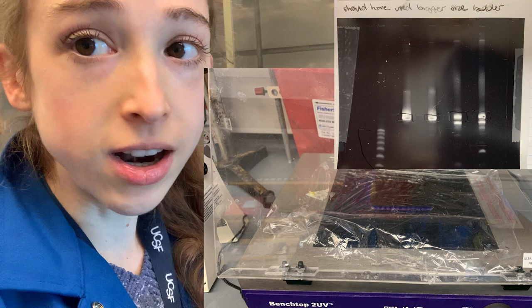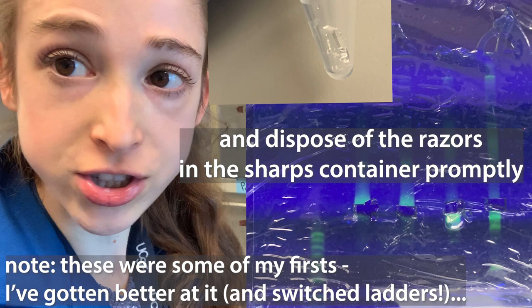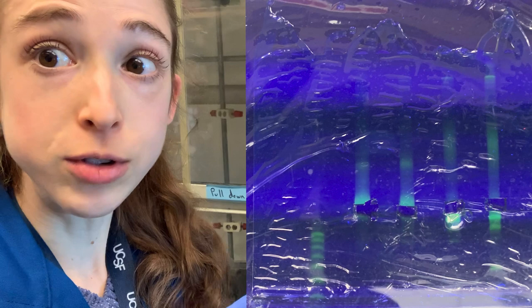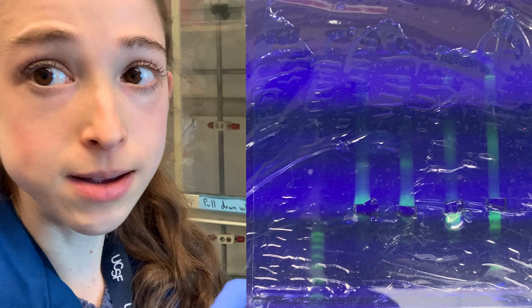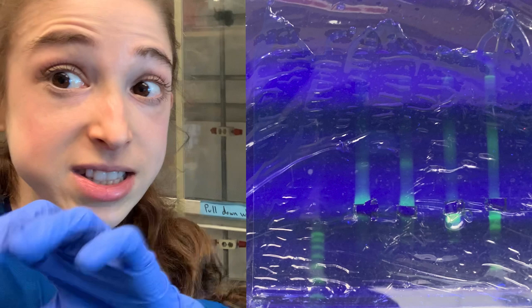When cutting out bands, cut as close as you can around the edges. Make sure you're using a clean razor for each sample to minimize contamination. To further minimize contamination, skip lanes between your different samples. If you have unique samples, you definitely want to space them apart, because when you're cutting you might get a little of one sample into another, and when loading you might have spillover into the adjacent lane.